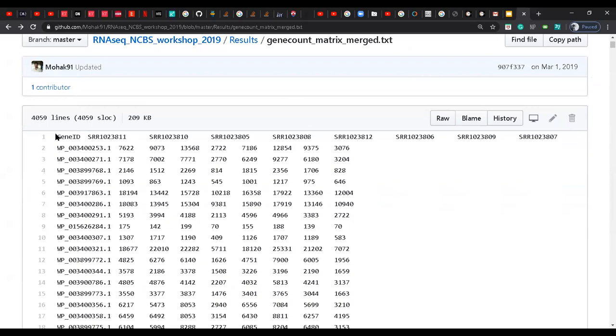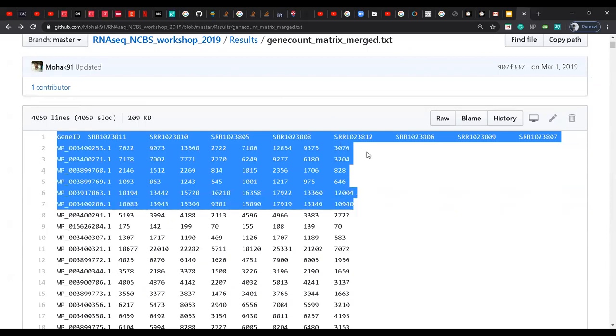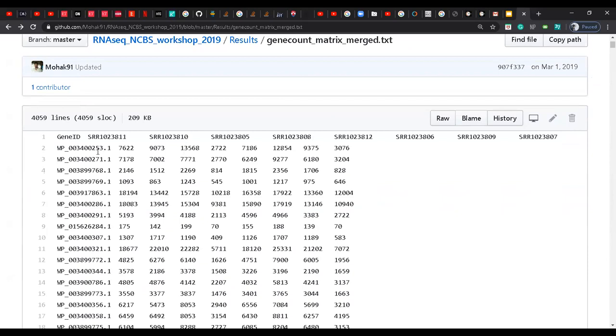So then basically what you want to arrive at is a matrix, which Nitish will do in the next class. It's just one step. As I told you, let's imagine that you had 1,000 reads that map to your genome after the BWA alignment that you did, and now all you want to see is, out of these 1,000 reads that mapped to your genome, how many of these fall in a region that codes for gene A versus gene B, C, D, and so on. So all you're doing is organizing your data, going from a generic mapping across the whole genome to the locus of each particular gene.